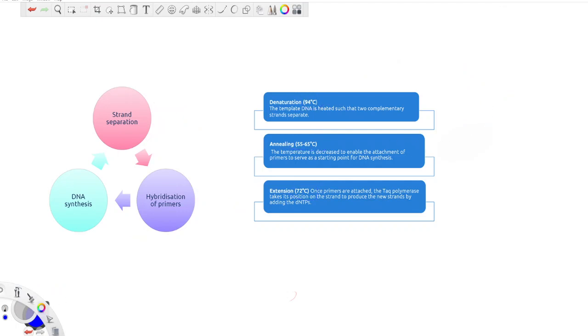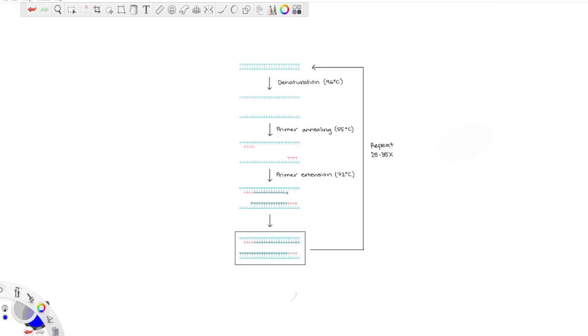All right. So once we have that, I think that's pretty much all we can talk about PCR at this level. This is a very nice picture that we've borrowed from Khan Academy. It shows that during this PCR reaction, you have a DNA strand, and here is your region of interest.